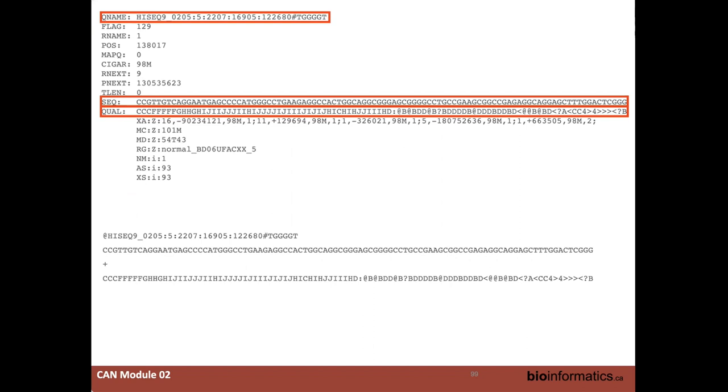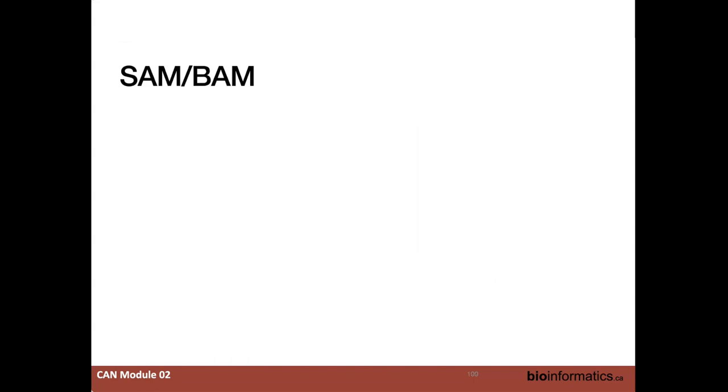It's a FASTQ. It's great. So this actually comes directly from the FASTQ information and then it just tags on some more details. Just be aware that you can go back and forth from a BAM to a FASTQ. It's much easier to go from the BAM or SAM to the FASTQ because you just need to slough off some columns and then reorganize them. To go from a FASTQ to a SAM file requires a separate tool. I just wanted to bring that up to you guys.